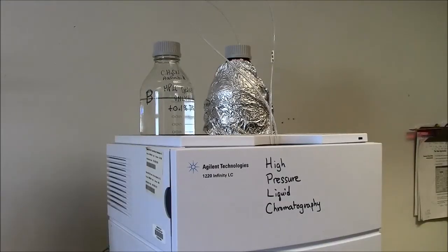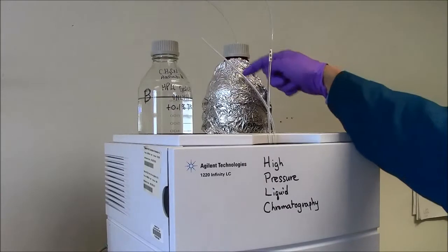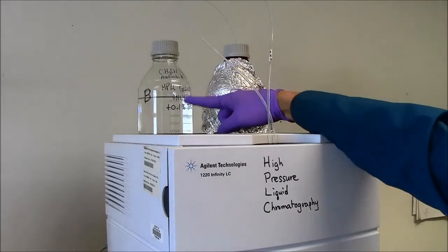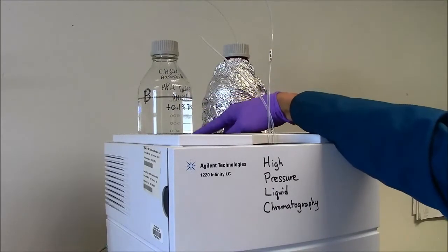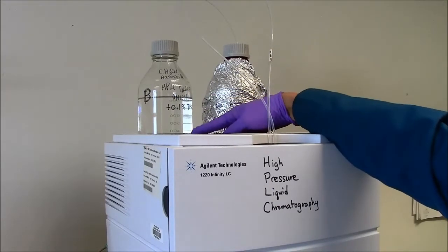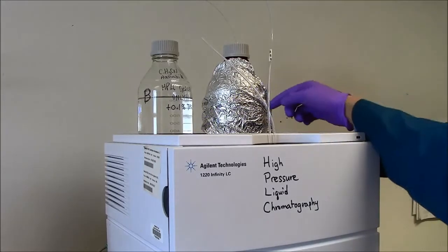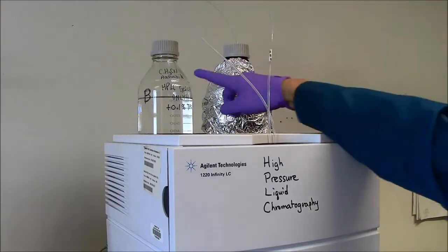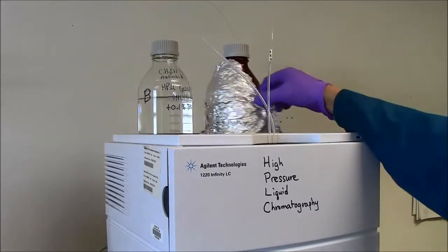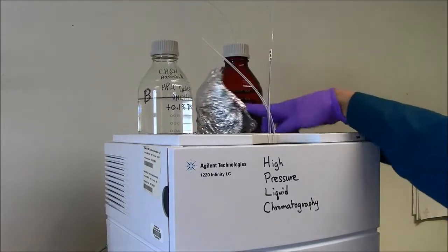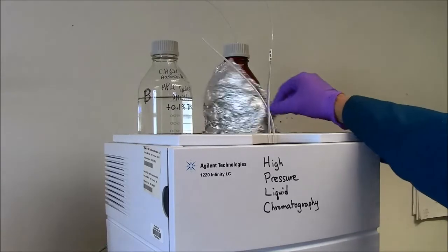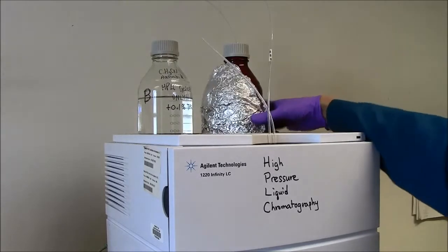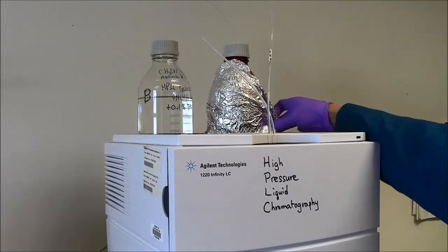Our solvent bottles are up here on top of the HPLC. Take a look at the level here. If this runs dry, that's bad, so when it's getting low, you should tell me. This is the acetonitrile. This is the water. The water is shielded because algae can grow if exposed to sun.